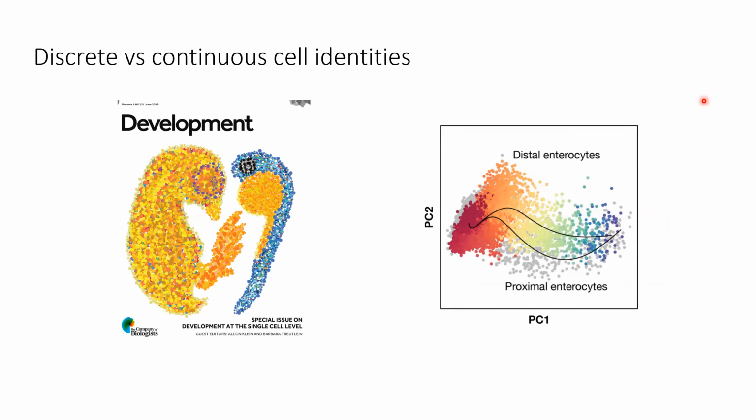So the question is, it looks like there are many different algorithms which give better or worse results depending on the nature of RNA-seq data. That is true. And is there something like a cheat sheet to choose appropriate algorithms or pipelines based on the data and questions being asked? And kind of. There are a ton of benchmarking studies that try to test how well each of these different kind of methods are doing. And I've read a lot of them.